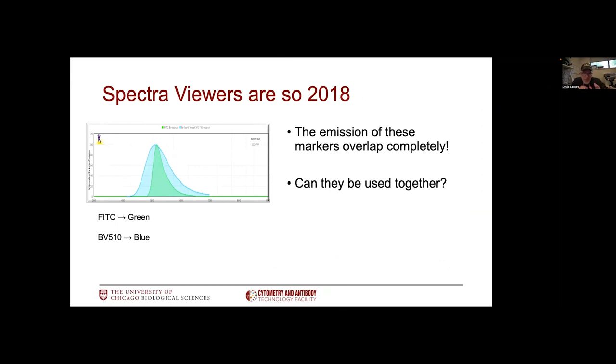Last point. For several years, we talked about spectral viewers as a way to predict the level of spectral overlap as you design your panel. If you use them, you might have noticed they are not always completely accurate. We have an example where FITC is the green line, the blue line is my BV421, and from the looks of it, they are right on top of each other and should not be used together. If you've done a bit of flow, you know FITC and BV421 works quite well. So what's going on here? Essentially, we're not getting the full information from the spectral viewers.